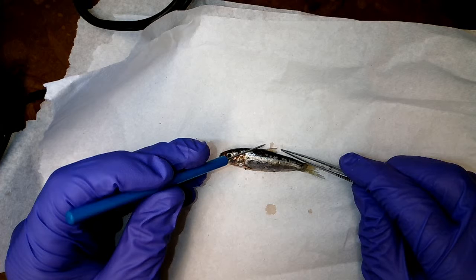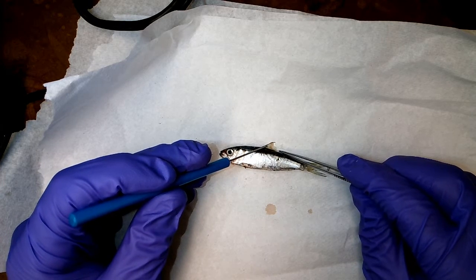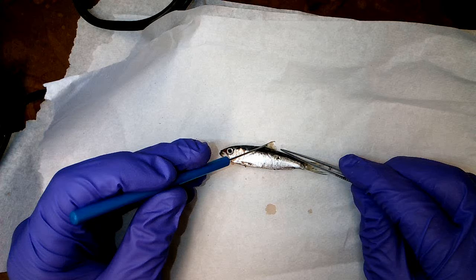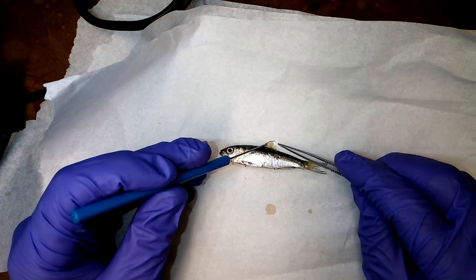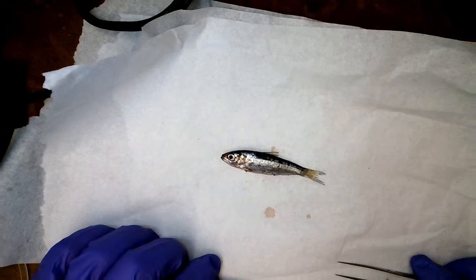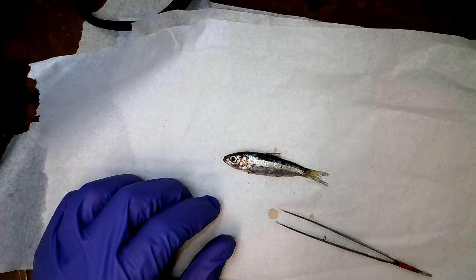Is it elongated? Elongated would be pronounced. You'd have this last ray kind of feathering out down the back here. Not the case here. They're all relatively even in length, so they're not protruding or elongated. So I'm going to move to 2. Okay, we have a terminal mouth and no elongated last dorsal ray.